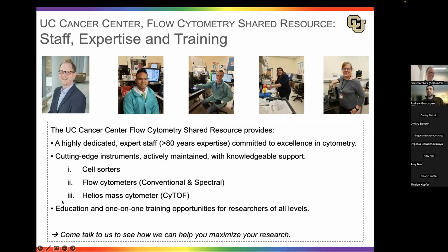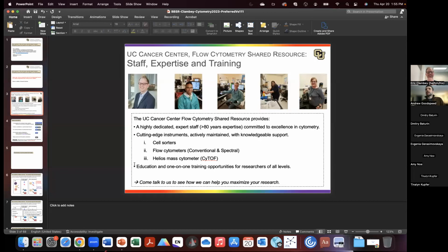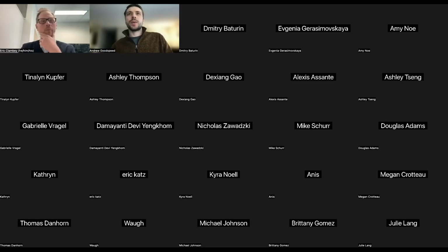Okay. Sorry. Yeah. And I had a question about how the acquisition portion goes. Do you train people to run the machines themselves, or are all the machines run by your group, or is there kind of a mixture? Yeah. So we have many people who we train to run the instruments, and they run them themselves. That's something we prioritize. We want to make sure that everyone has the ability to run these instruments, especially the cell analyzers.